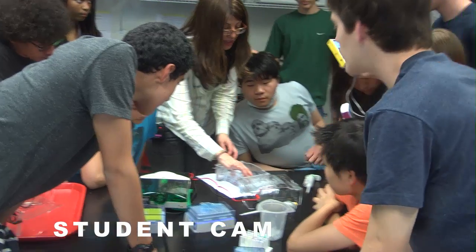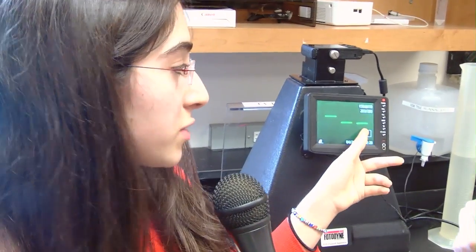It was the PV92 locus. So what we did was take those DNA samples — samples 12 through 14 — we saw their bands and found out they were homozygous positive, homozygous negative, and homozygous negative. Mimi, what was your genotype? My genotype was homozygous positive.